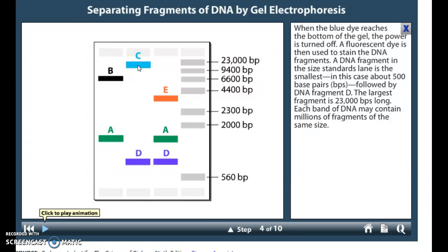But if you want to know more specifics about a quantitative value, they can put a control group over here. So what they do is they add specific fragments of DNA that have known lengths. And here they have a variation from 560 base pairs, and BP stands for base pairs, that's just nucleotide sequences, so that'd be 560 nucleotides strung together. Then they have all these other variations.